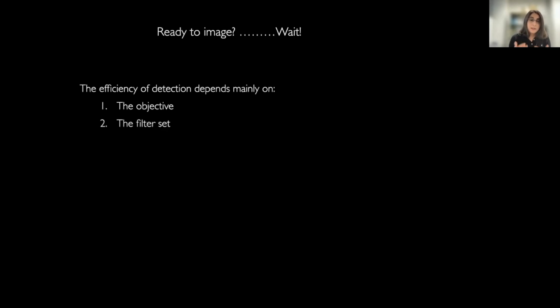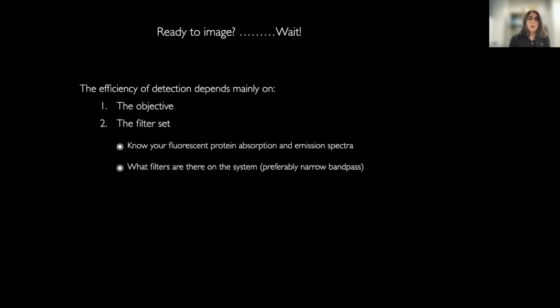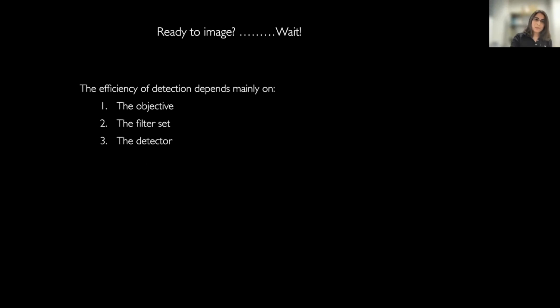Next then is the filter set. You want to know your fluorescent proteins' absorption and emission spectra, and you want to also know the system's filter sets that it comes with. Filter sets had also been discussed in another tea break. Please have a look at that too.